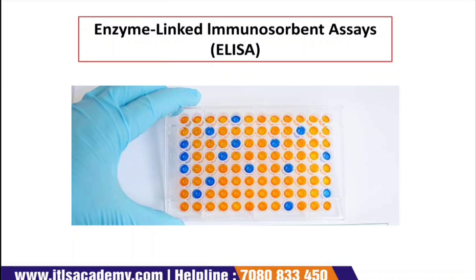For example, ELISA is highly sensitive and very specific. This method is very versatile and at the same time flexible. It gives you a quantitative analysis and it is cost effective.